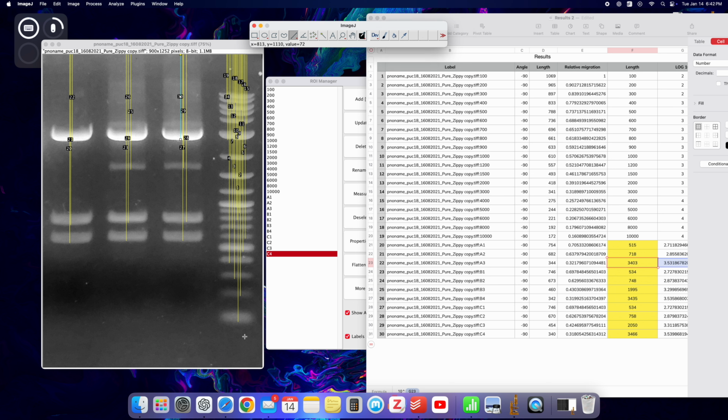Of course, the better you put these lines here, the better it would be for measurements. I would suggest just center those and be as consistent as possible. And of course, make sure that your picture is completely horizontal, so no skewing to the right or to the left.